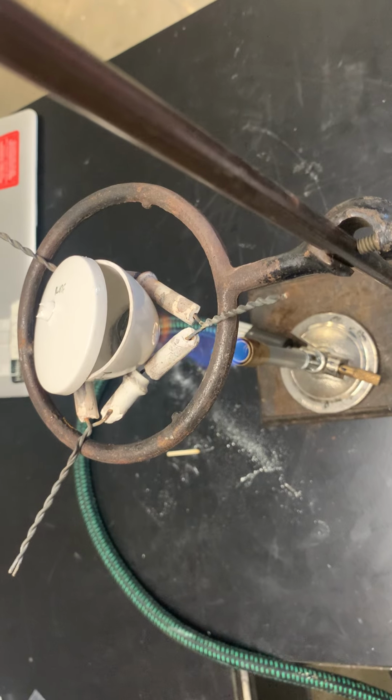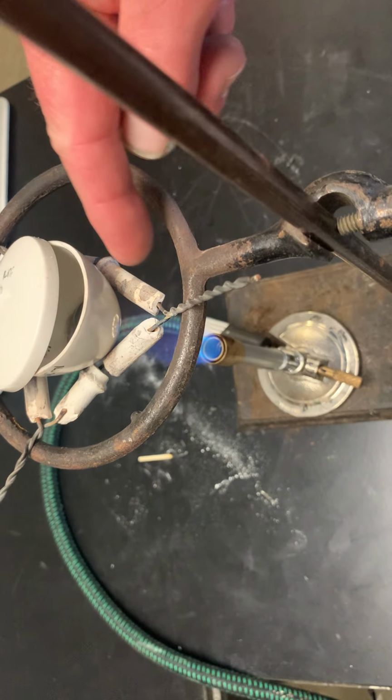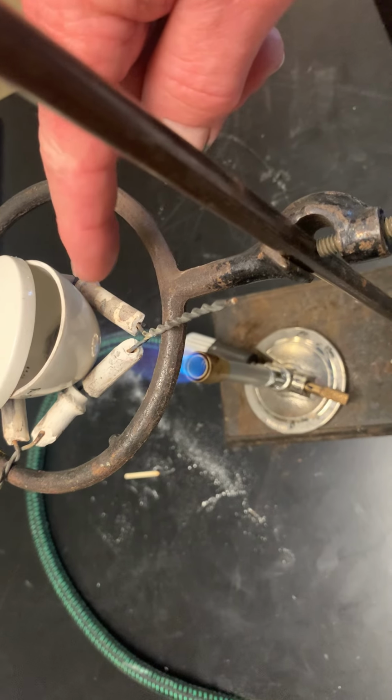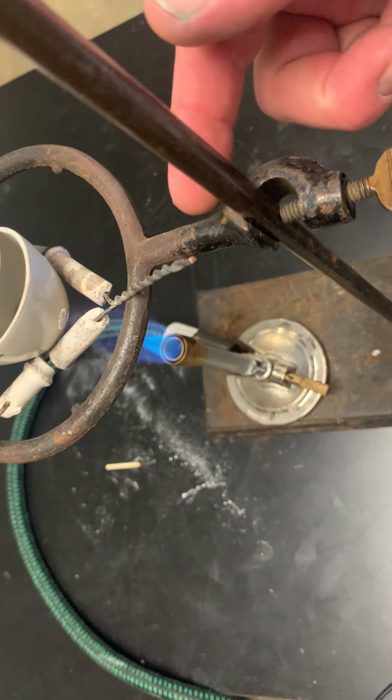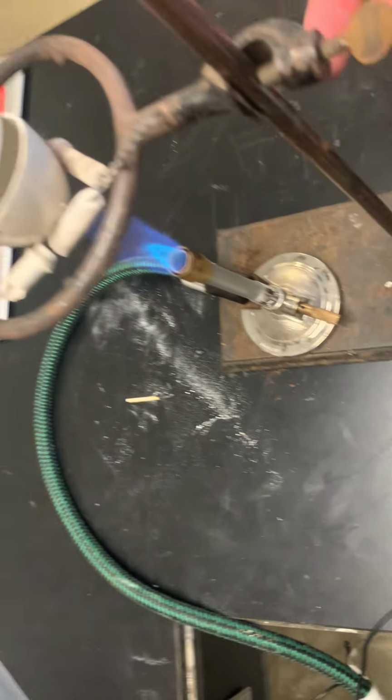Let me just point out a few things, just because this piece right here, it's called the clay triangle. It holds the crucible and the lid. This is the ring, and this is the stand for the ring. So it's called the ring stand.